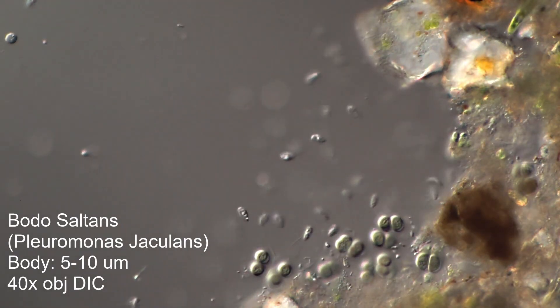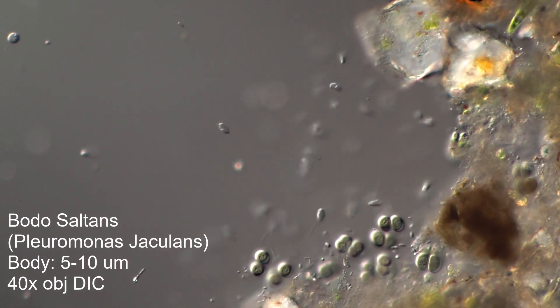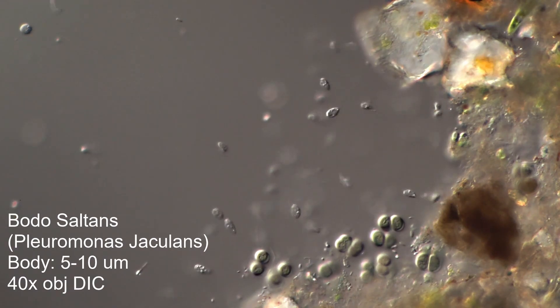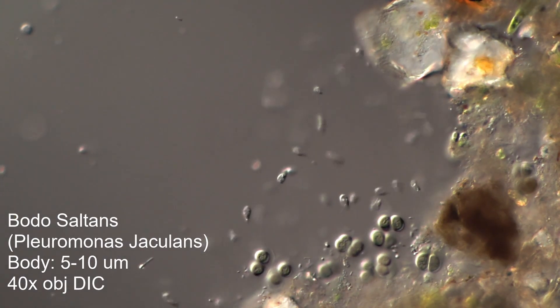They have two flagella. There's a long one they use to anchor themselves, and then there's a short one they use to produce violent motion on the end of that tether.